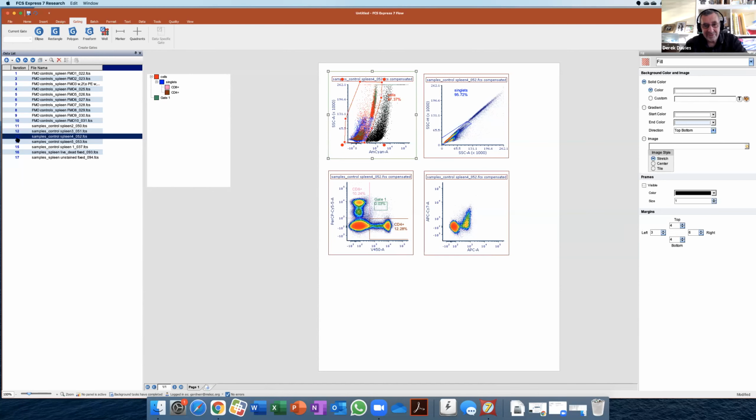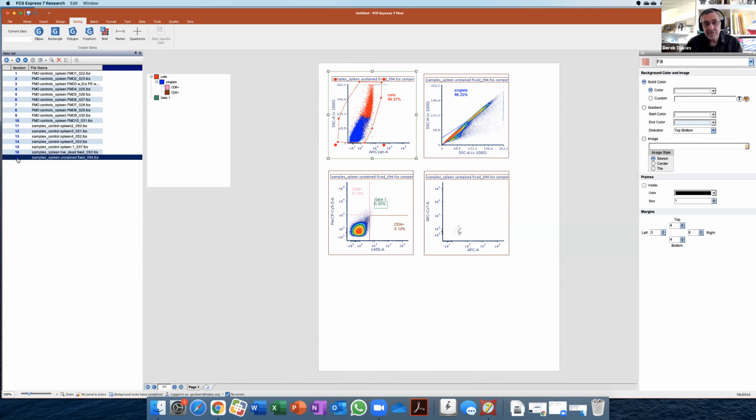Sorry, go ahead. There's another question, but you were going to say something continuing that theme. Okay. Well, there's another question about can you use the negative control for the double positive CD4 and CD8? And again, I would say no, because that's not the correct control. You won't be able to define what is positive with the negative alone. You need to have the two FMOs, the CD4 and the CD8, to be able to do that.